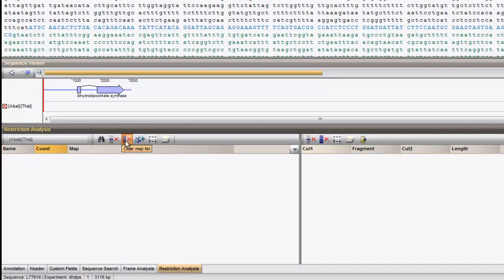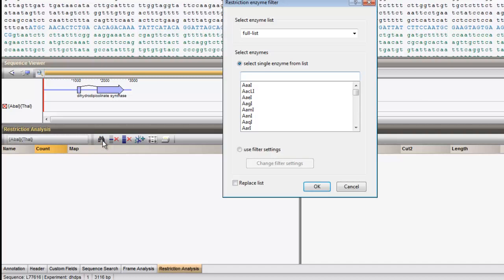Restriction enzymes can also be selected by using more general criteria. Click again on the binocular button and use the filter settings.